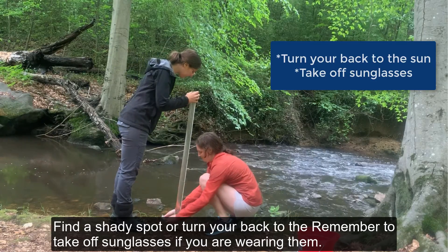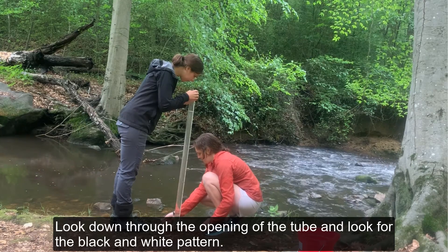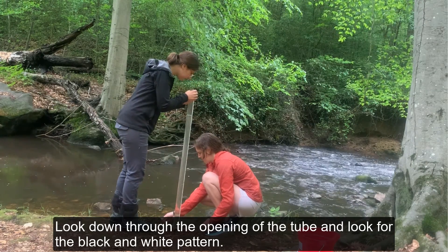Find a shady spot or turn your back to the sun. Remember to take off sunglasses if you're wearing them. Look down through the opening of the tube and look for the black and white pattern.